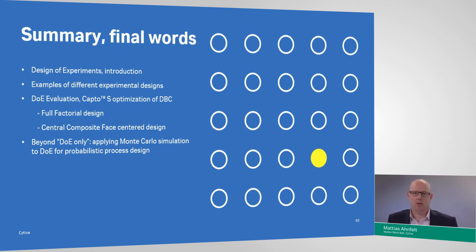We can really try to make our processes as robust as possible by optimizing where we choose to operate within our investigated space.